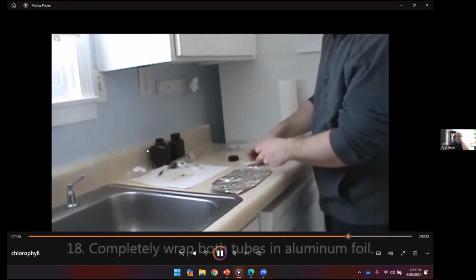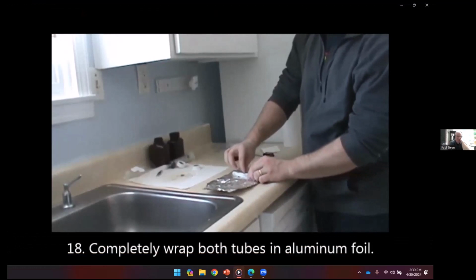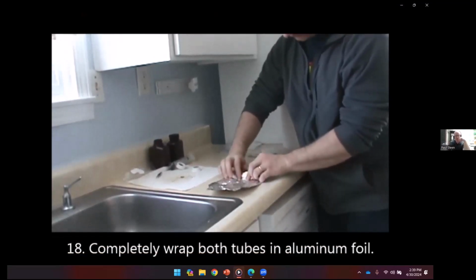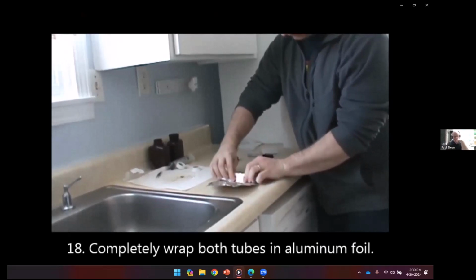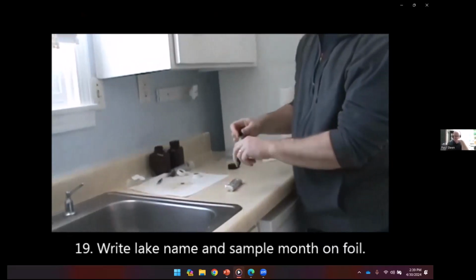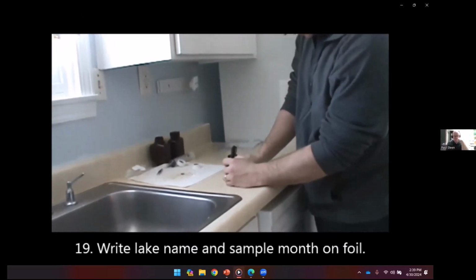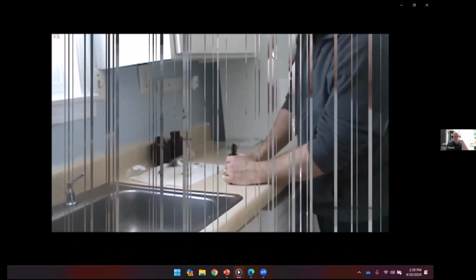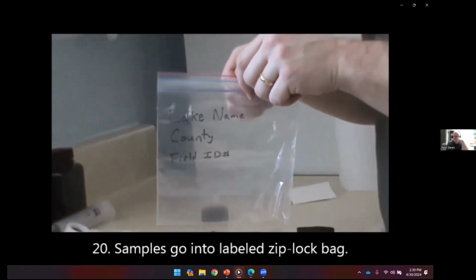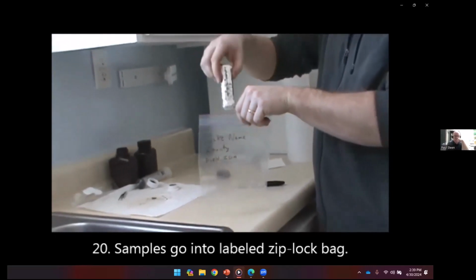Once both samples are complete, wrap the vials completely with aluminum foil to keep all light out. This foil wrapping step is critical. Unwrapped samples cannot be accepted for laboratory analysis. Write your lake's name and the sample month on the foil packet. The samples go into a Ziploc bag with your lake name, county, and field ID number.